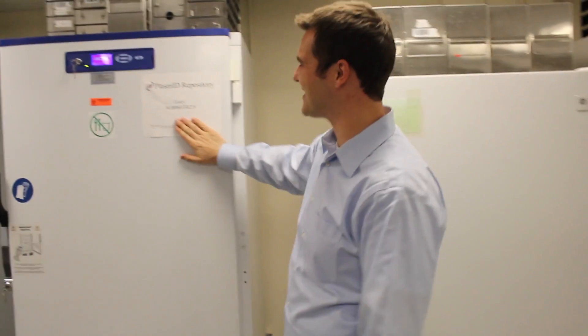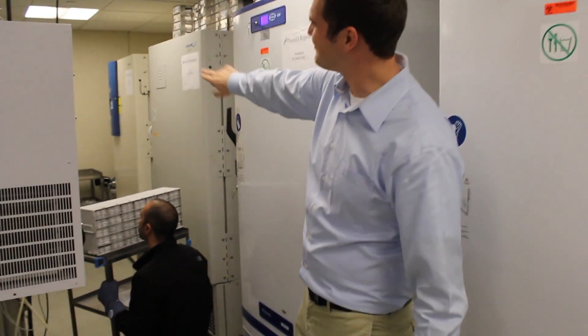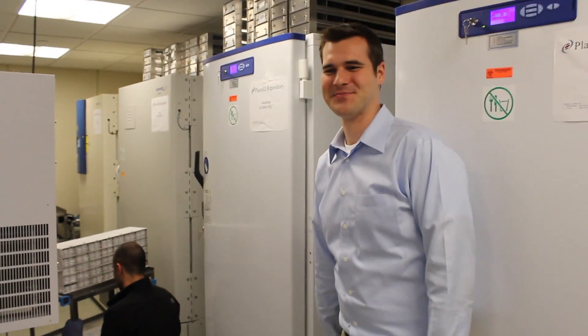For us, it's important to focus on the energy use of our freezers because we know that each freezer uses approximately the same electrical consumption as a full house on an annual basis. We want to make sure that our footprint is as small as possible. We obviously have quite a few freezers, 10 different freezers in our farm. We want to make sure to squeak out every last bit of efficiency so that we're not causing an undue burden.